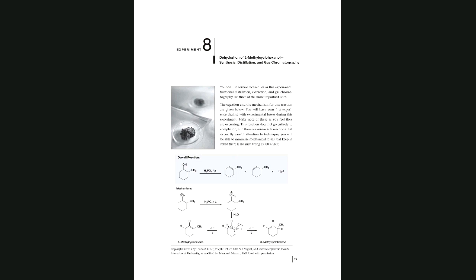Yes, in order to know if you can use the simple distillation or not, you need to know the boiling points. They are not far enough apart. If they are not far enough, then you cannot use the simple distillation. So we are using a 50 milliliter round bottom flask. Okay.